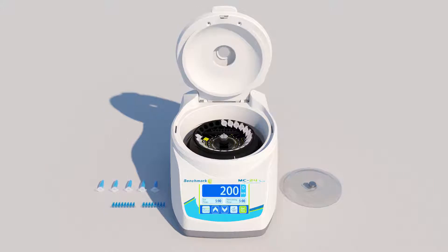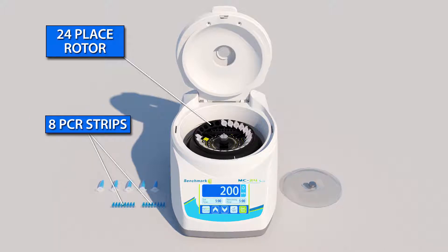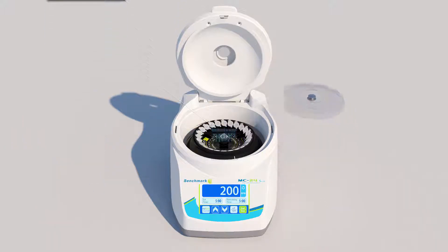Included with the MC24 Touch is a unique 24-place combi rotor for microtubes that also features slots for two 8-place PCR strips or 16 0.2-milliliter PCR tubes in the same rotor.